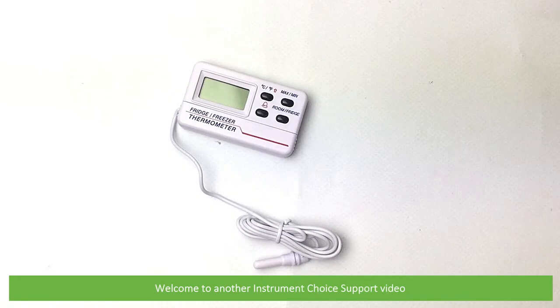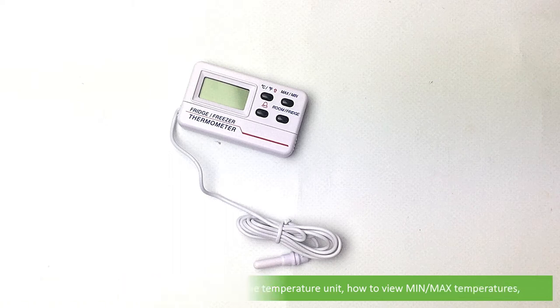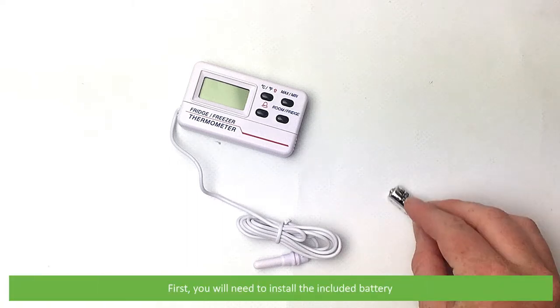Hi and welcome to another Instrument Choice support video. In this video we'll demonstrate how to use the IC7209 digital thermometer for fridges and freezers, including how to get started, how to change the temperature unit, how to view minimum and maximum recorded temperatures, how to set the alarm, and how to change the display between fridge and ambient mode.